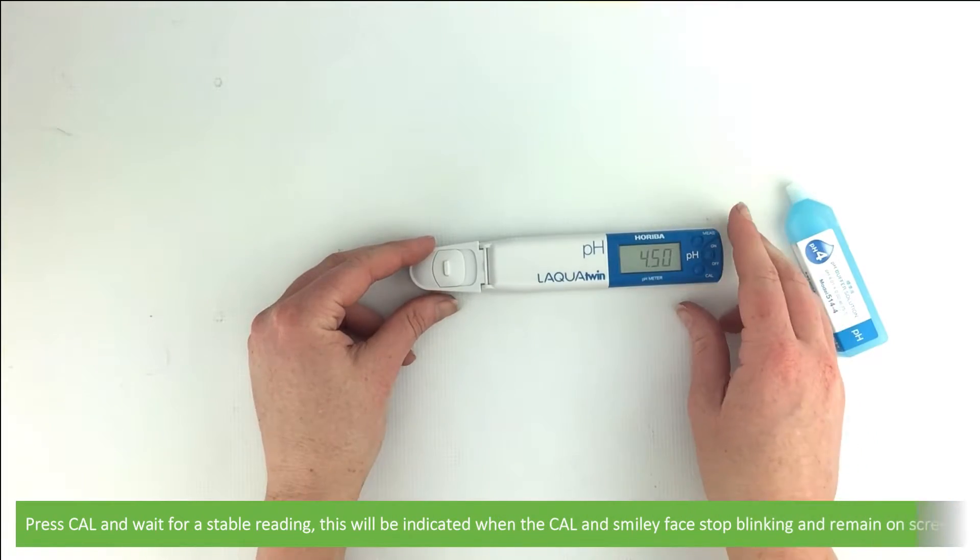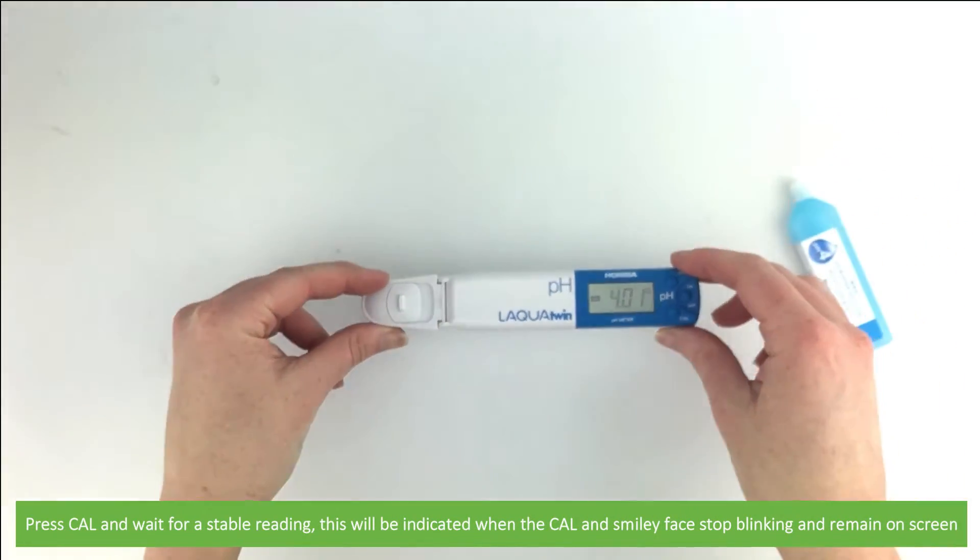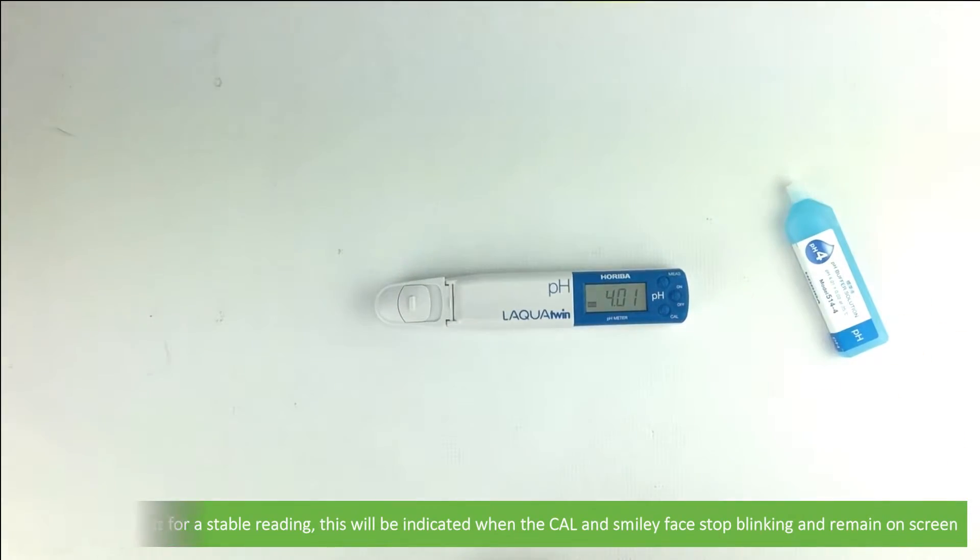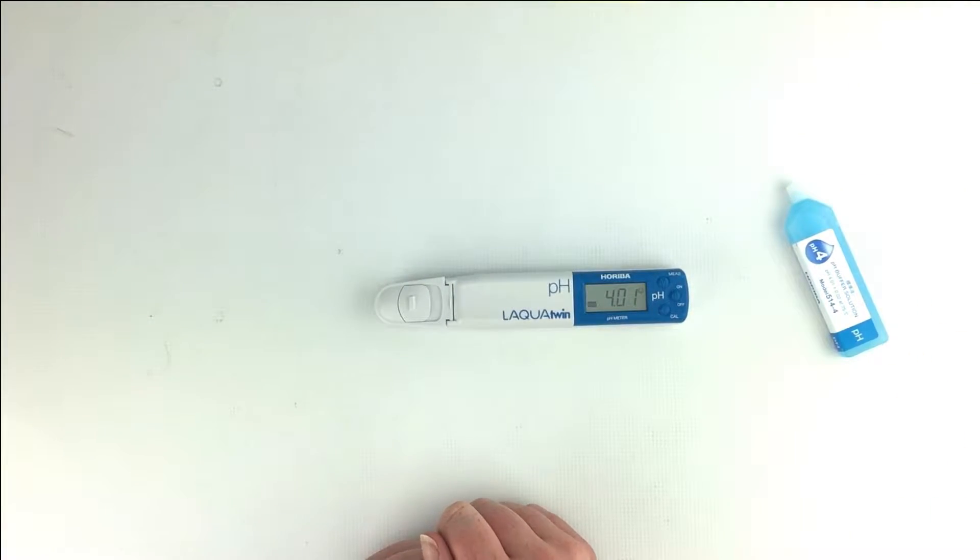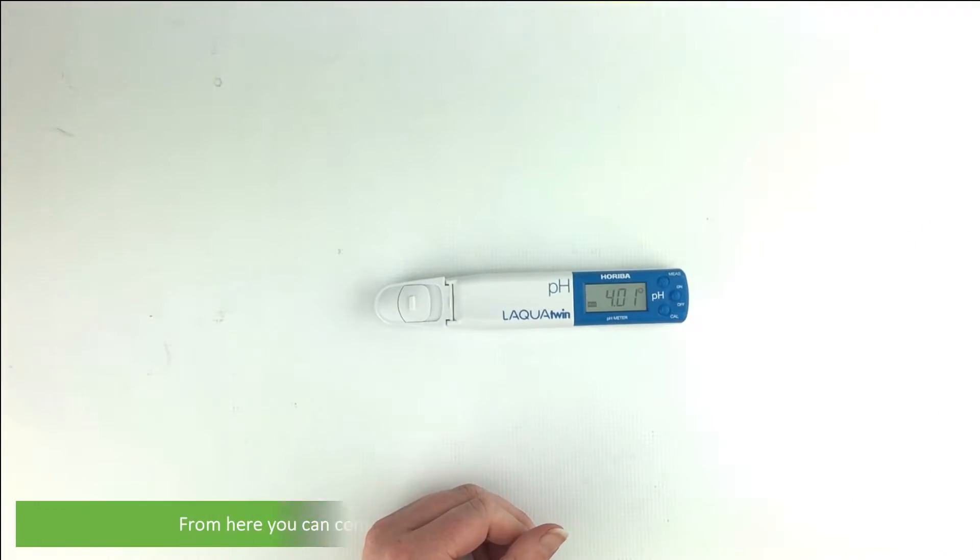Press Cal and wait for a stable reading. A stable reading is indicated when the Cal and smiley face stop blinking and remain on the screen. Then the device will return to measurement mode.